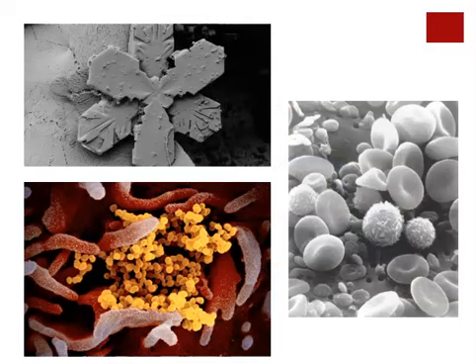Now take a look at these amazing images. These were taken under electron microscopes. And what you can see here are 3 images of scanning electron microscope technology. Remember, the scanning EM shows us surface details. Transmission EM shows us the internal workings.